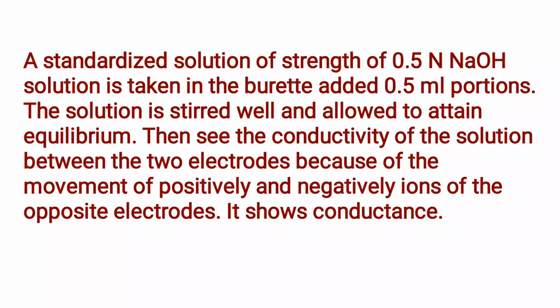The solution is stirred well and allowed to attain equilibrium. Then we see the conductivity of the solution between two electrodes because of the movement of the positive and negative ions to the opposite electrodes. It shows the conductance.